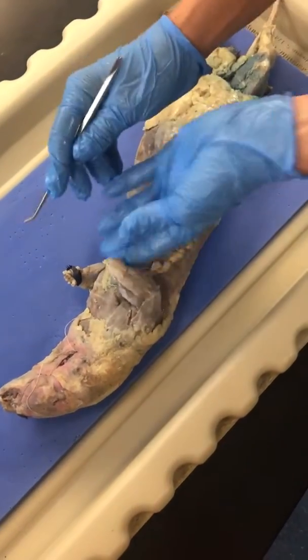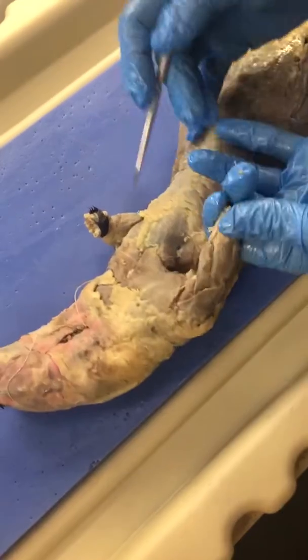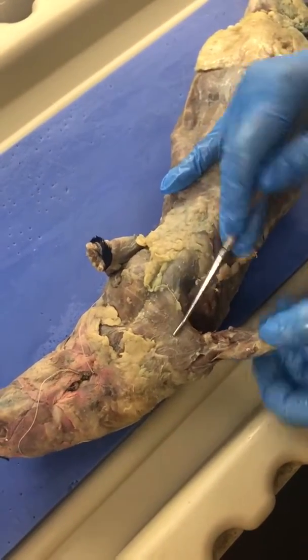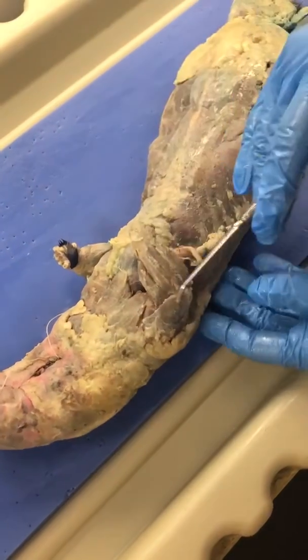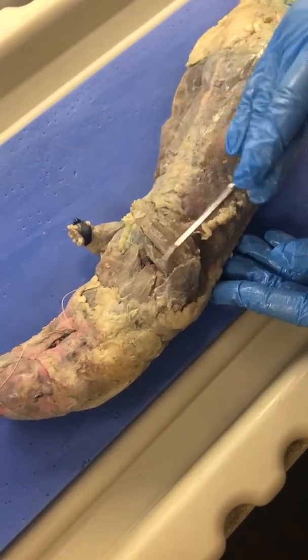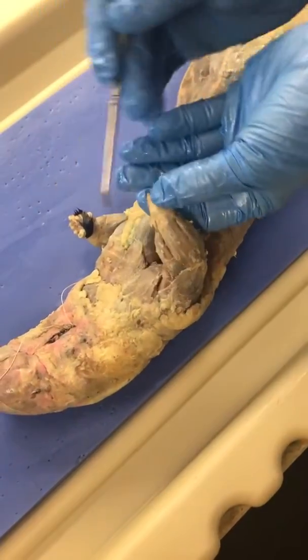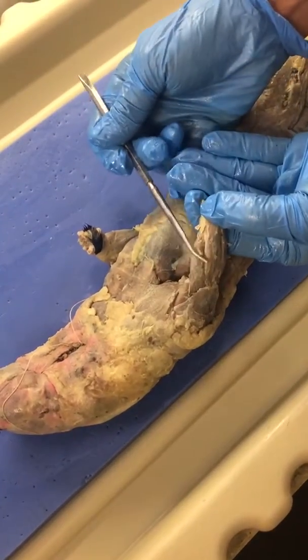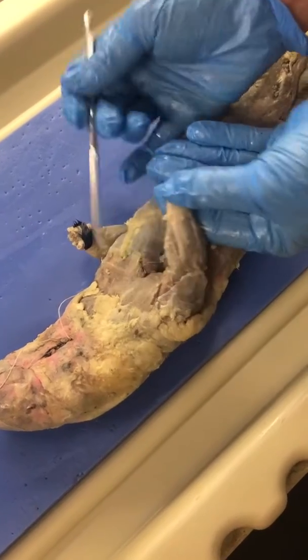Okay, so here are the arms. I'm going to point out a couple things. So pectoralis major, and then this is the posterior surface of the arm. This would be where the thumb is, and this is where the pinky is. So this means this is the extensor carpi radialis.